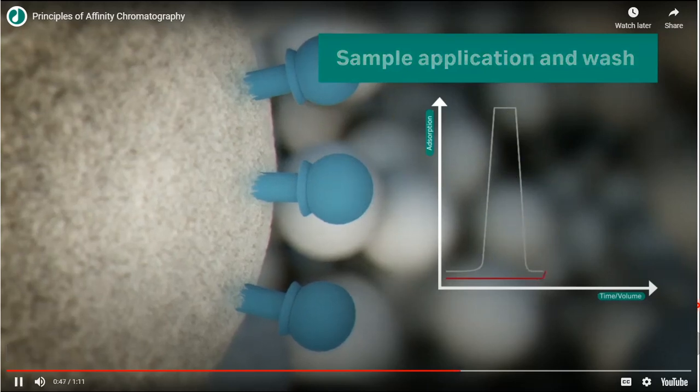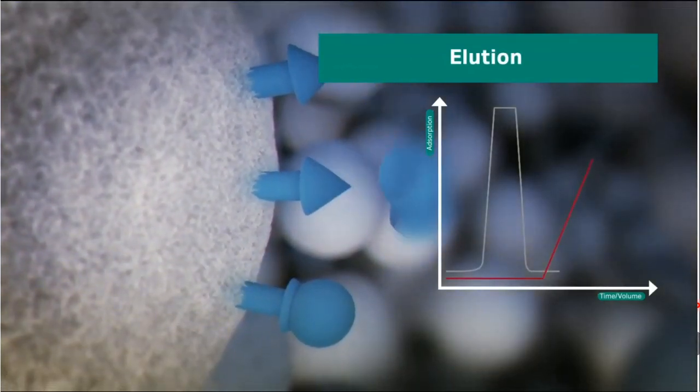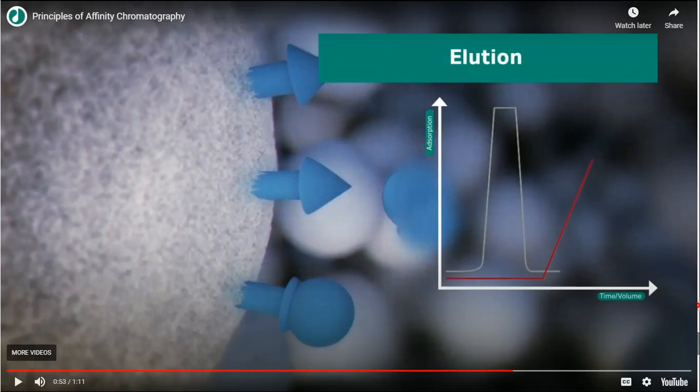In the third step, elution, biomolecules are released from the biospecific ligand into the elution buffer. So this is the elution method. For one type of elution, you can use the same ligand molecules at a higher concentration, and the ligand will bind directly as a competitive binding, and automatically the protein may be detached from the matrix, and you can get it. You can use the free ligand concentration to liberate it. Again, the free ligand can be separated from your molecule by dialysis.